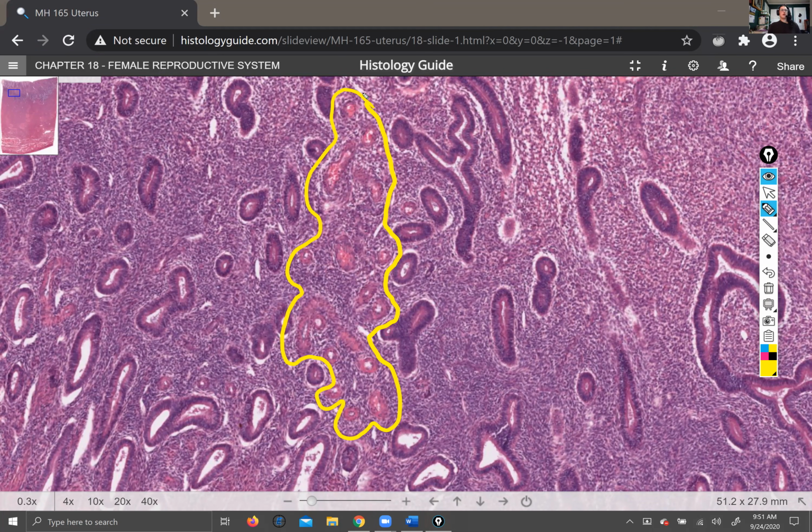Well, imagine a spiral. A cylindrical spiral, like a spring. Now imagine that you cut it along its length, such that the only representation you have of the spiral is looking at its cut length. It doesn't look especially spirally now, does it? And yet it used to be because you sliced it, right? So that's what these arteries would look like if you could see them in 3 dimensions. They would look like a messy spiral, where they would be kind of doing this.